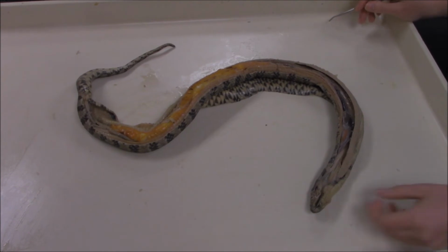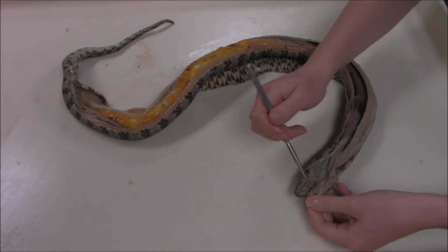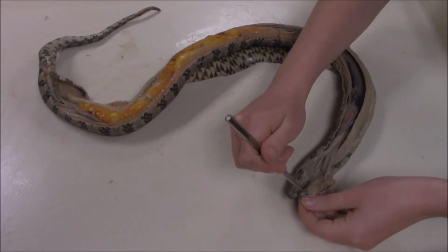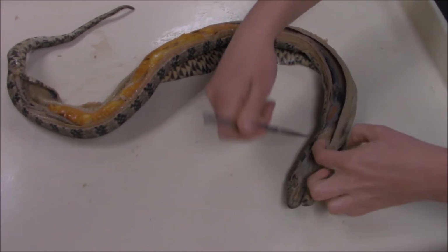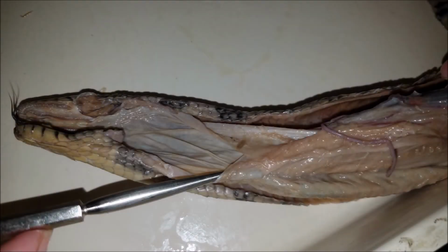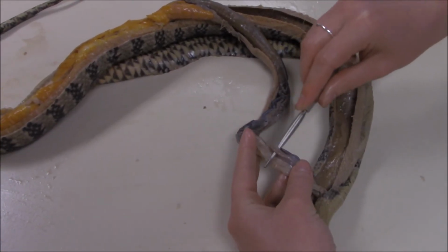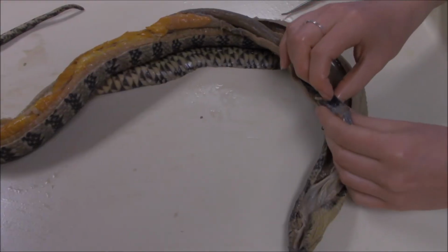So this is our non-venomous snake, and we are using this as our representative snake. As you can see here, below the tongue, this small opening is the glottis. This connects to the trachea and is used in respiration. This is the esophagus, which is highly elastic to allow for swallowing large prey items and moving them to the stomach. This small tube that we are pulling out is the trachea. It is formed by small cartilaginous rings which are not entirely fused, so it's more of a C shape.